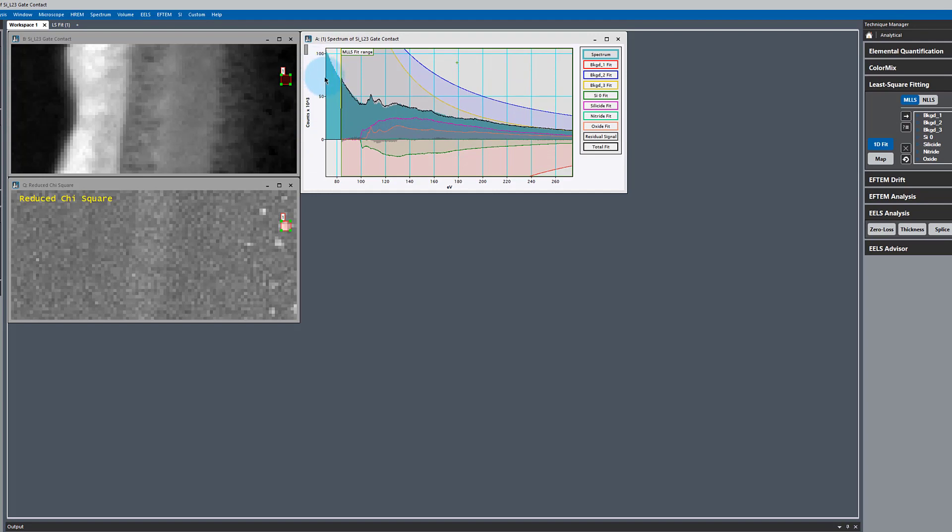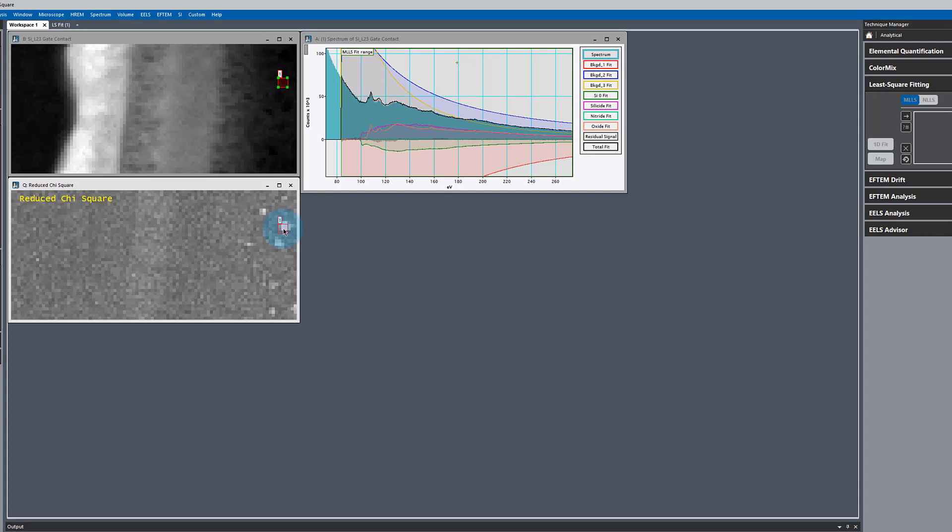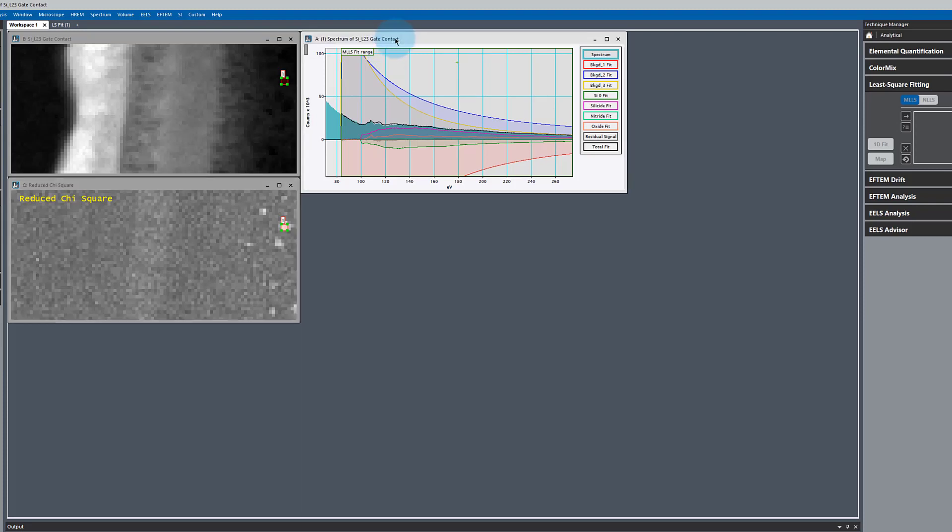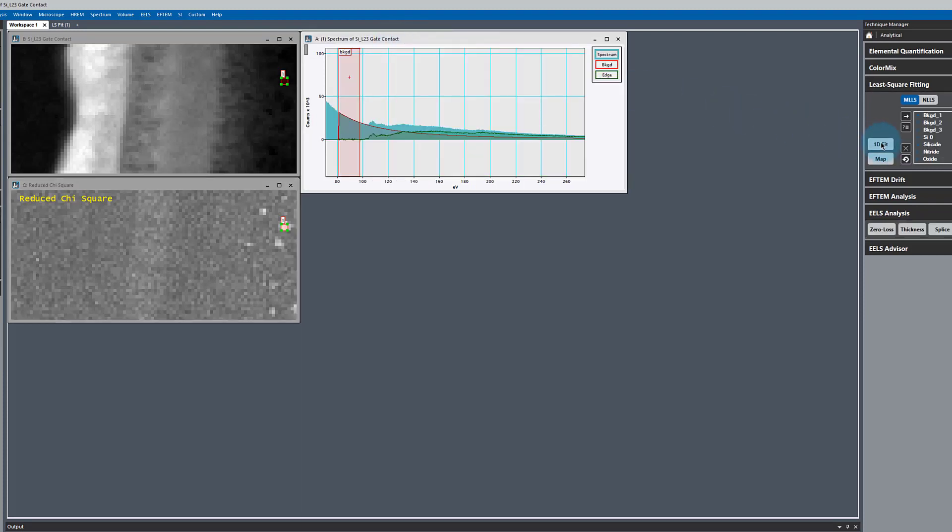Here's negative coefficients that it's adding in. It's adding negative coefficients here and a whole bunch of all three of these positive, and it still doesn't fit very well. There's a pretty big shift here and here. It's just not giving us a good fit.